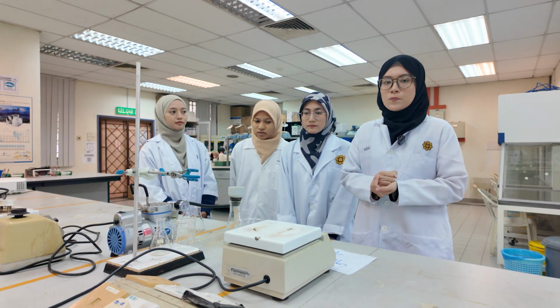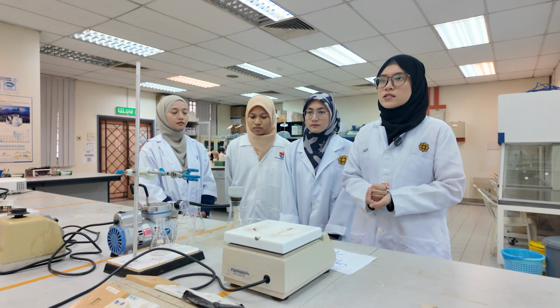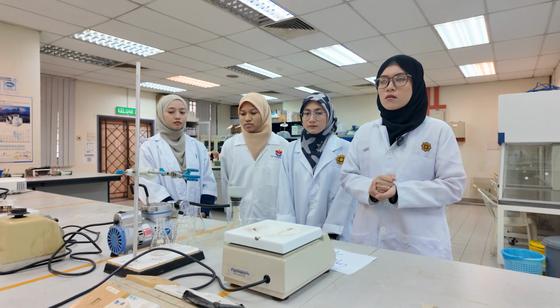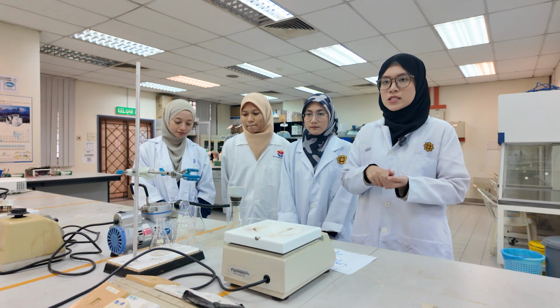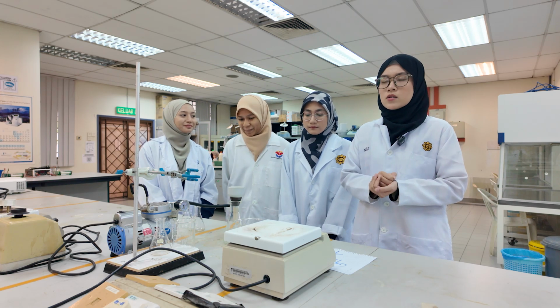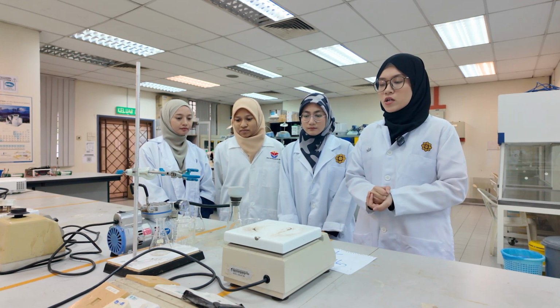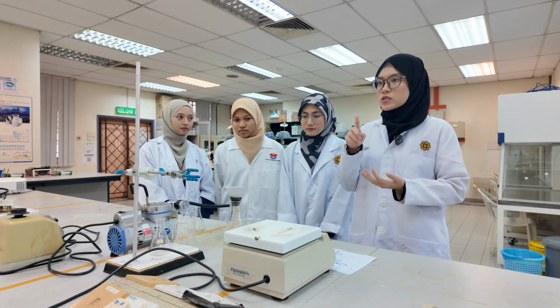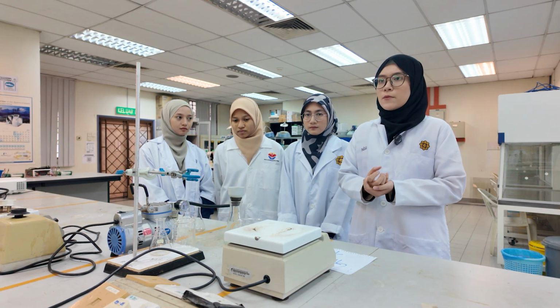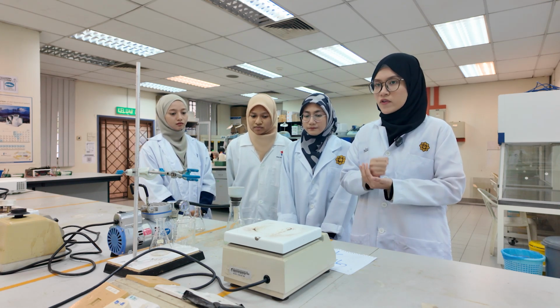The key principle of this technique is decided by the compound solubility, and the compound solubility will increase along with the temperature. So it means that the solid compound will be dissolved in the hot solvent.